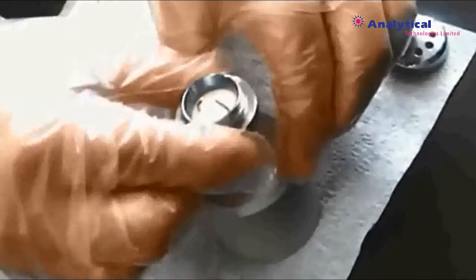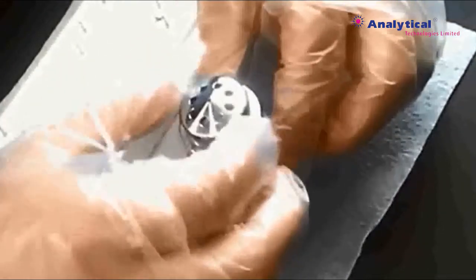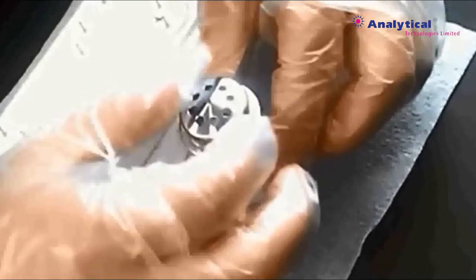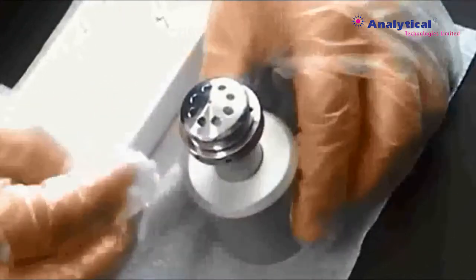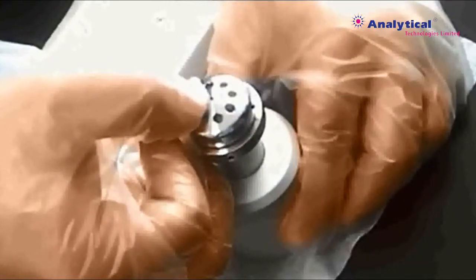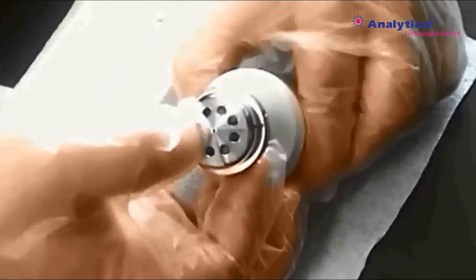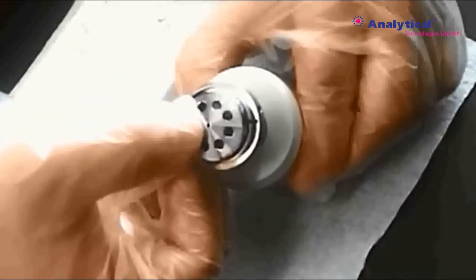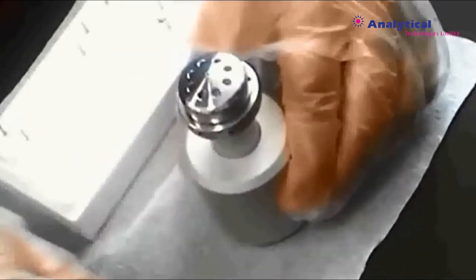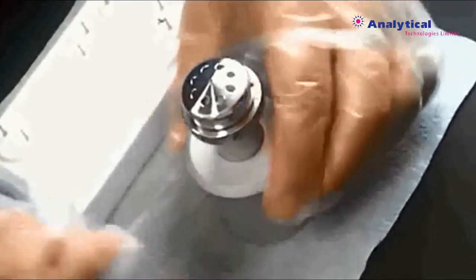Check if the bottom of the cylinder and the filament are secure. Then, assemble the top part of the wehnelt cylinder. Take care to make sure that the tip of the filament is not damaged. Check to see if the center hole and the tip are on the center circle. If not, screw and unscrew the bottom screws to make the tip be placed in the center.